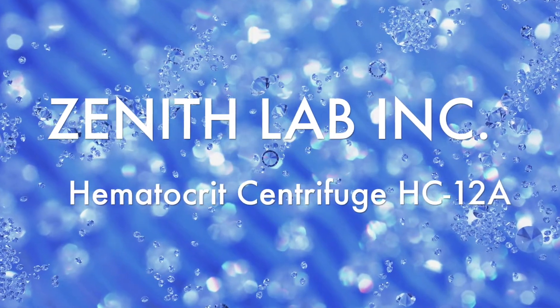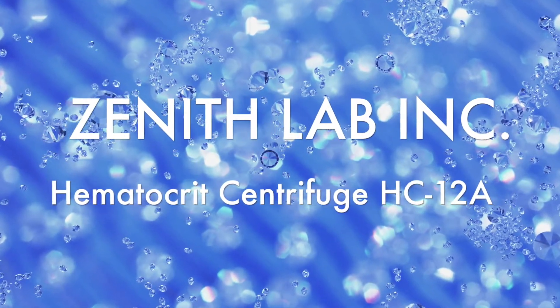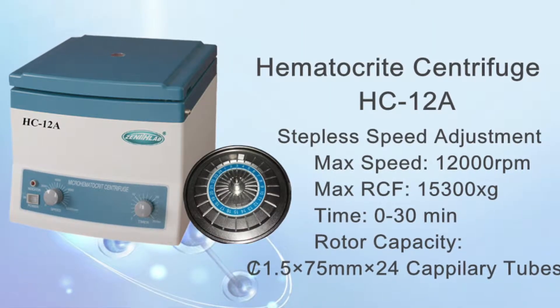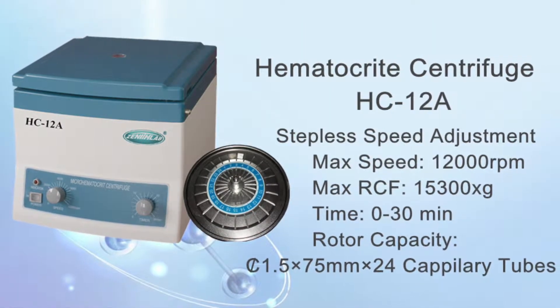Zenit Lab Inc. Hematocratic Centrifuge HC-12A. The 12A model is an analog device with a brushed motor.